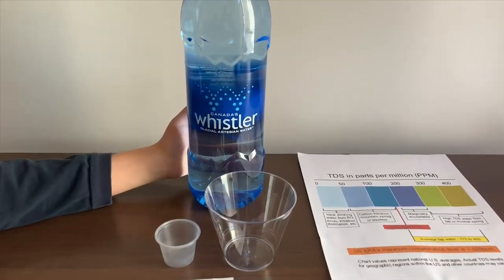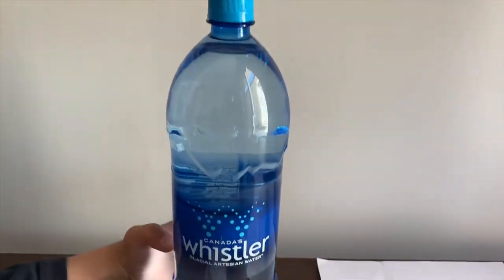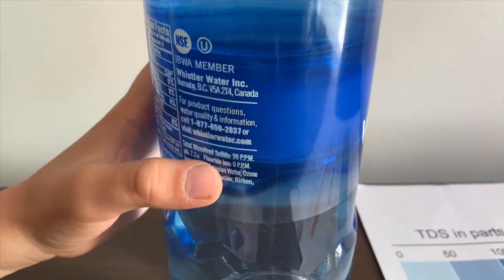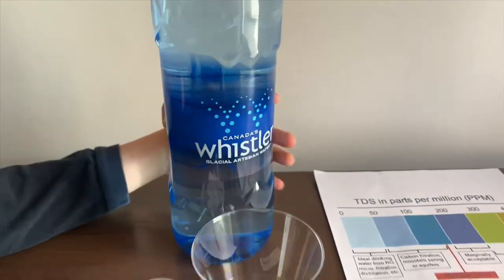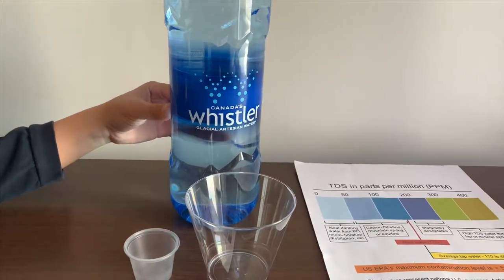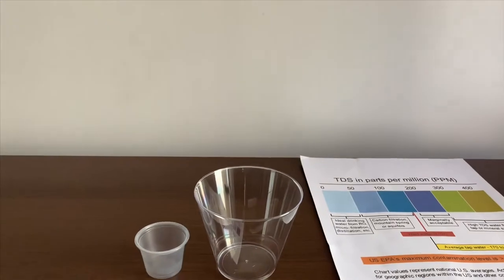This is Canada's Whistler artesian water. It says the pH is supposed to be 7.2 or higher. It's sourced from British Columbia, Canada. Let's test the pH and TDS level.